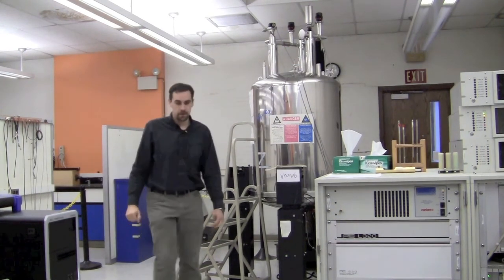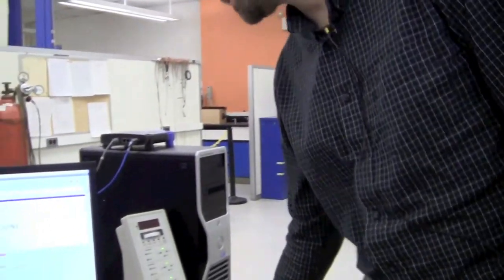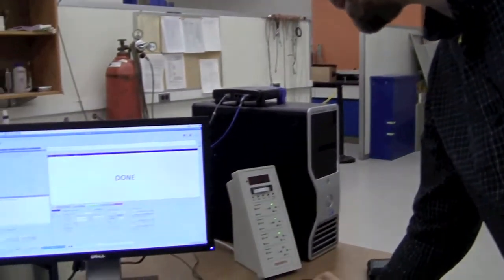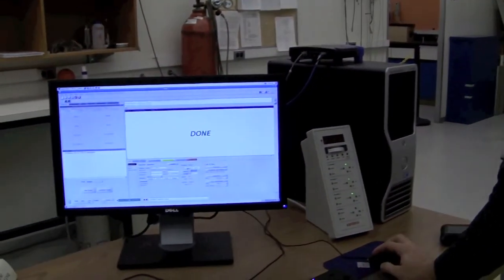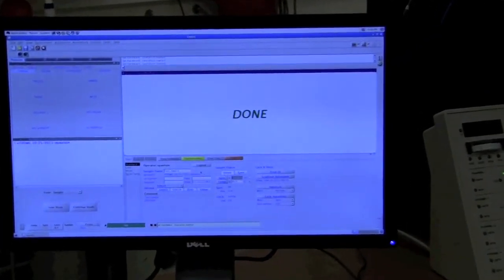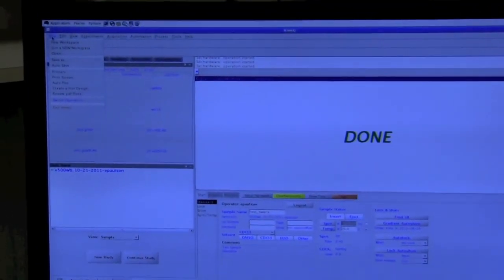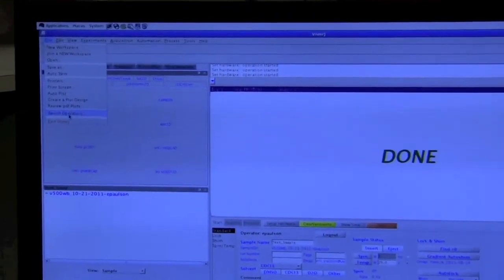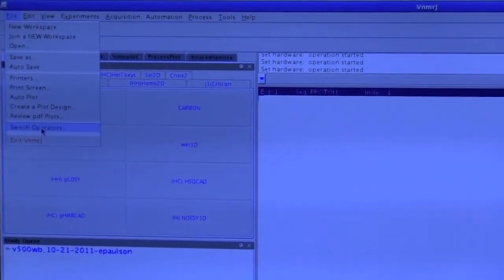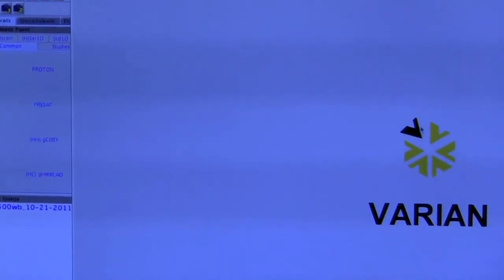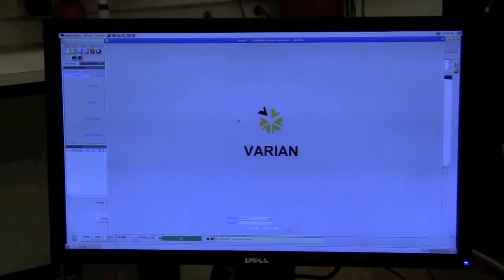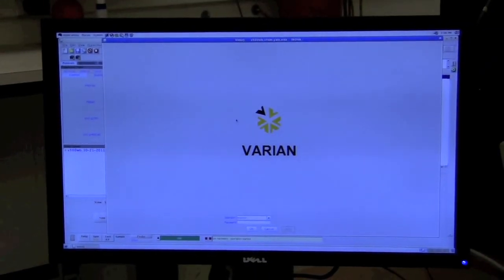Okay. Finally, we can click insert to put the dummy sample in. And then we can go to file, switch operators. It'll bring back the login screen and it's ready for the next person.